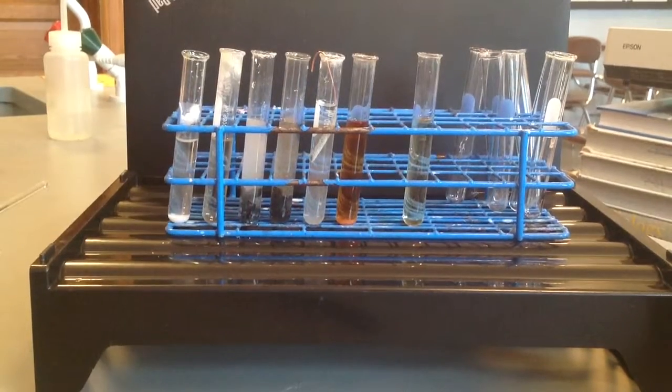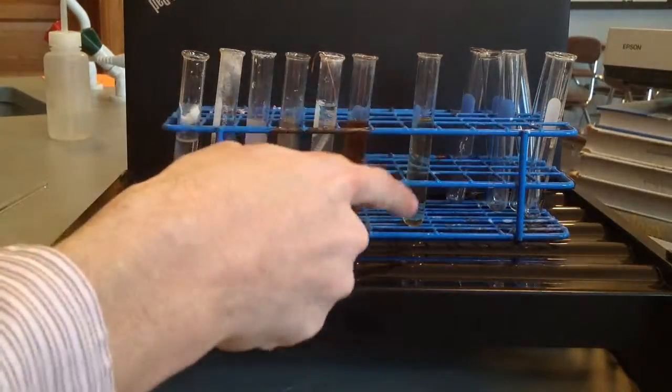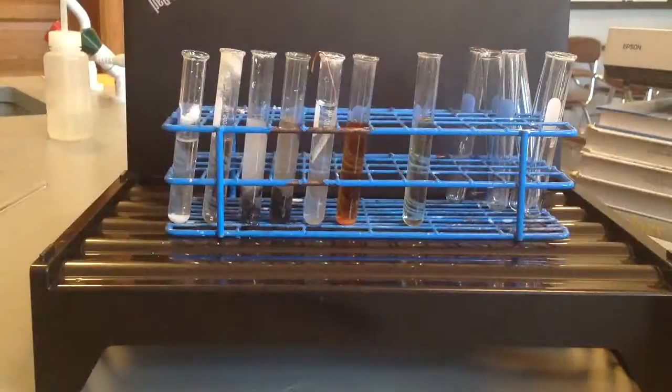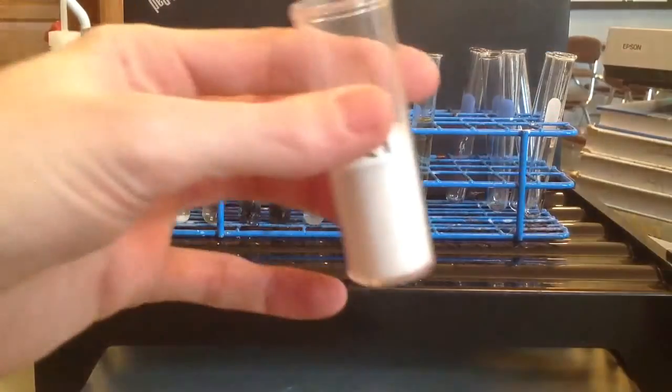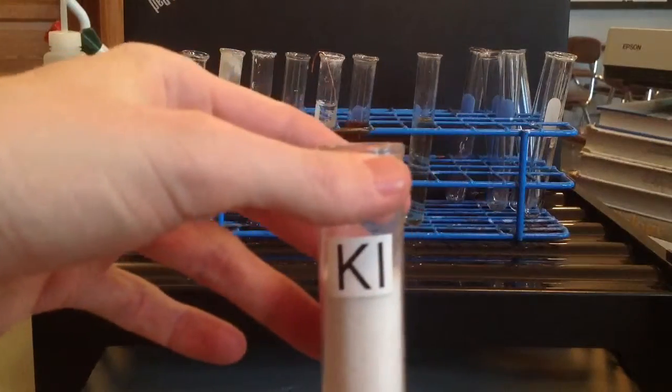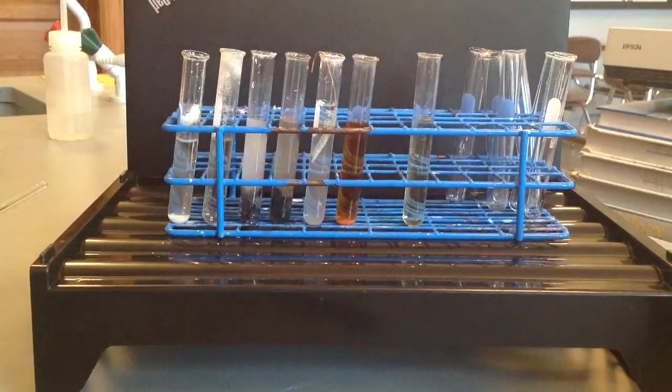Okay, so now for the next part of step five, we're going to be adding potassium iodide. Again, we're switching out the sodium iodide for potassium iodide and adding that to bromine water, or aqueous bromine. This is the test tube with the aqueous bromine. Make your observations of just that, and then I'm going to go ahead and add potassium iodide to that. All right.